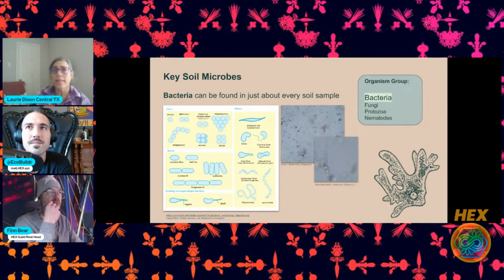They're $20,000 up to the microscope that I have at A&M, which is $1 million. But with direct microscopy, we identify by morphology, so their shapes. You can see the coccus, which is just a little circle. You can see rods, which is bacillus. You can see shapes like this.